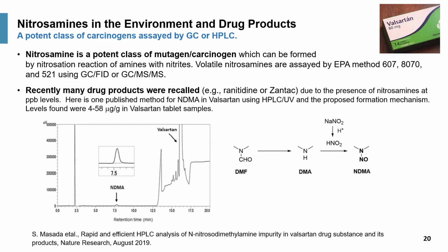I'd like to make at least some comments on nitrosamine, with a side twist: not just in the environment, but in drug products, which became a very hot topic because some nitrosamines were found in some pretty common products such as Zantac, and also in this particular application here, valsartan, the high blood pressure medicine.